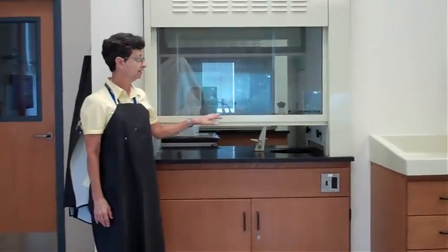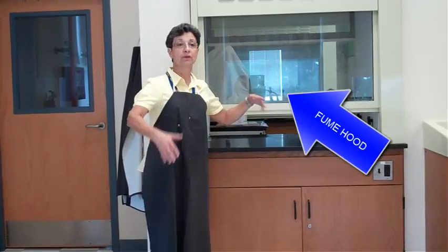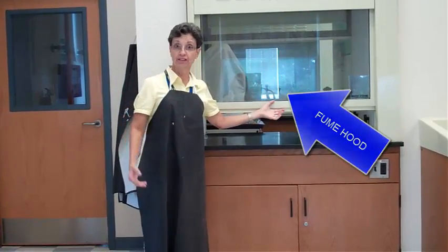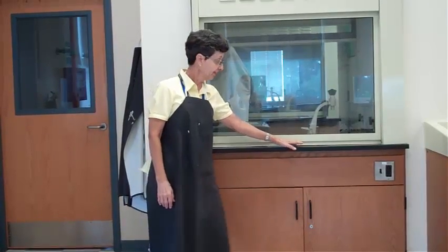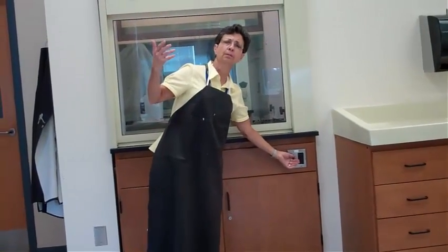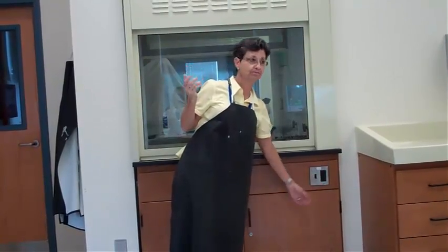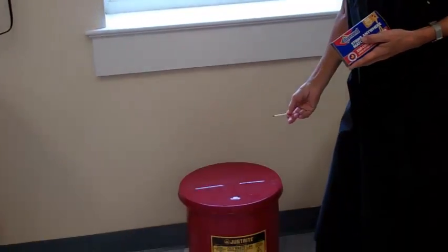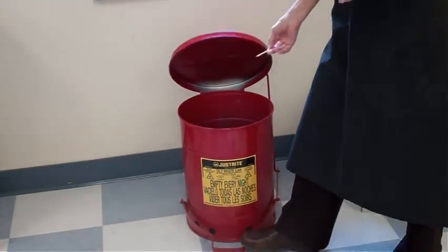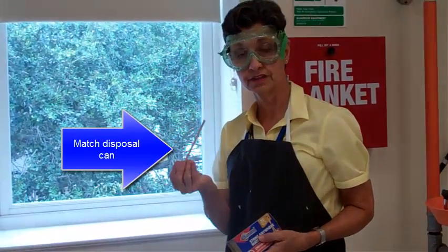Over here is the fume hood. This is the place where I do any experiments that could be dangerous or release a lot of fumes that we don't want to be breathing. I will close this window and then turn on the vent — it's very loud, but it does the job of filtering out any harmful substances. If you have any matches, be sure that they are completely out before disposing of them. They will be disposed of in this red can. That works for wooden splints as well if they are used.